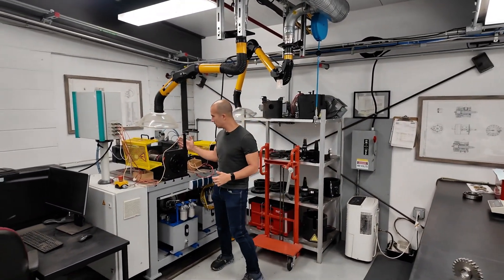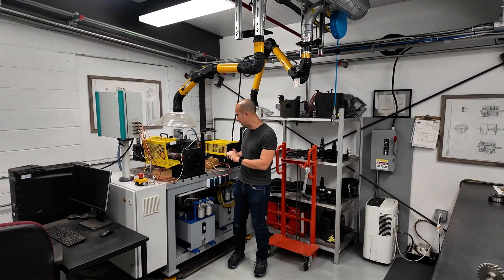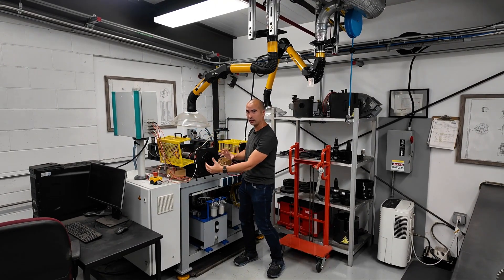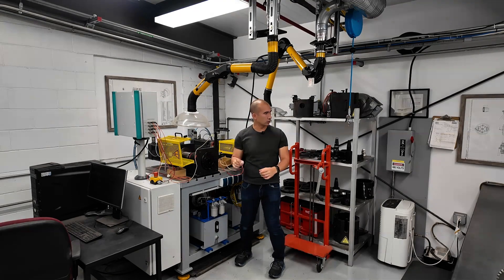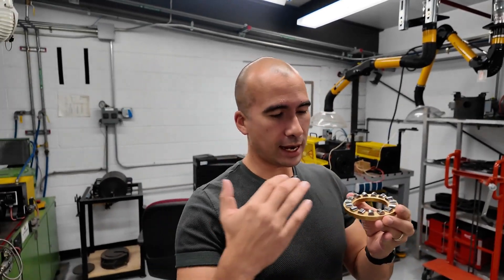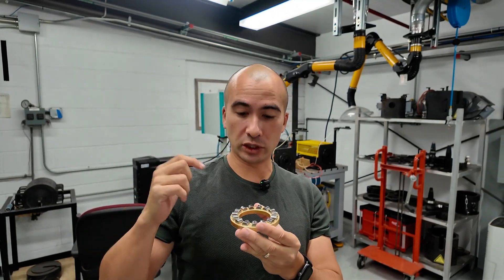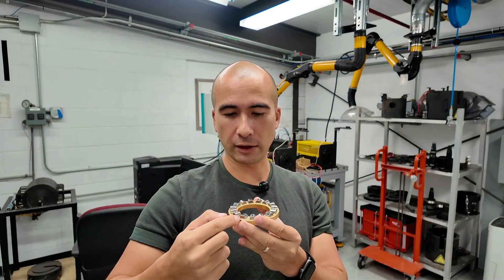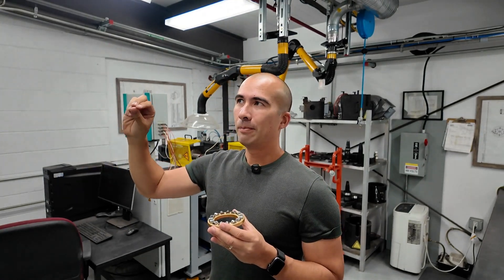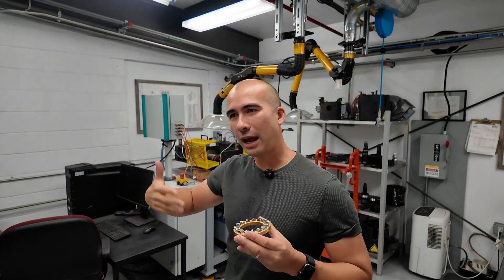Over here we have an FE8 bearing wear tester. The best way of demonstrating this: you can see we've got a motor at the back which is supposed to spin, and everything sits in a housing on the front. This would be an example of the bearing that's used. As it wears, what we get is mass loss both from the rolling elements as well as from the cage. Those are the two ways that we score this particular test — the amount of cage wear as well as the amount of rolling element wear.